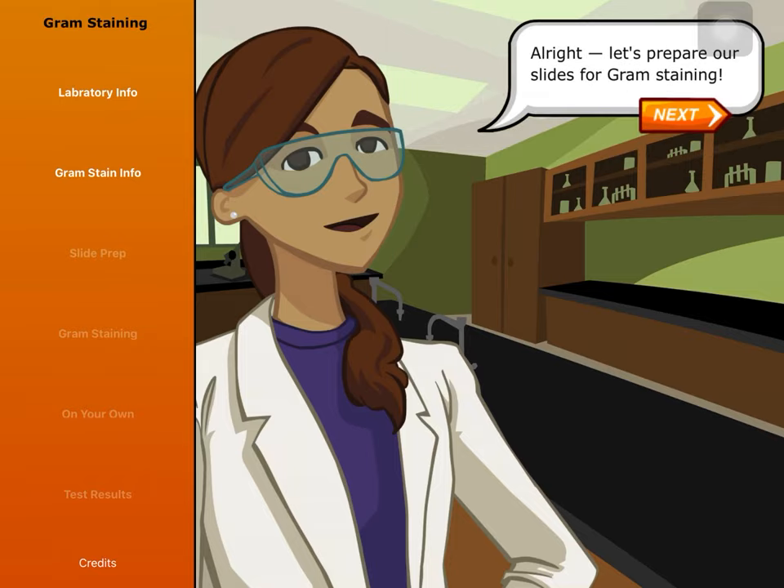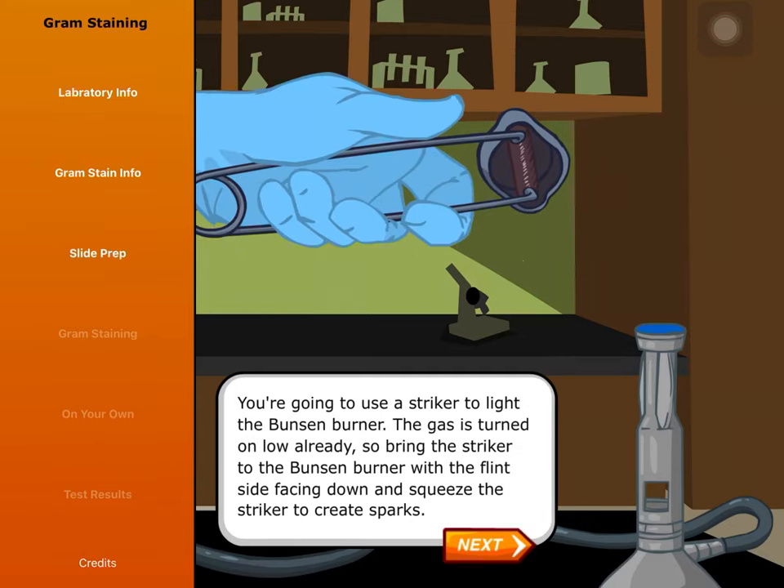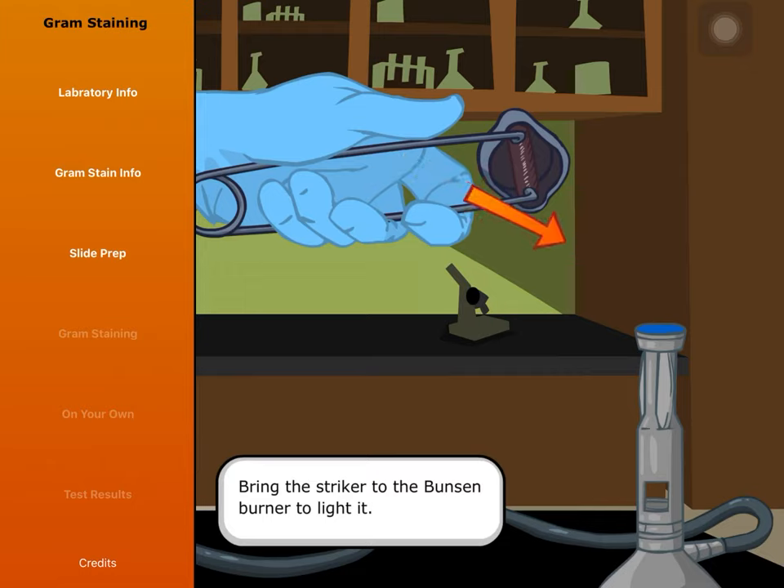Alright, let's prepare our slides for gram staining. To prevent bacteria from contaminating our work area, we have wiped down the table with a 70% ethanol solution. We will also light a Bunsen burner to sterilize the inoculating loops we'll use later and help maintain a sterile working environment. You're going to use a striker to light the Bunsen burner. The gas is turned on low already, so bring the striker to the Bunsen burner with the flint side facing down and squeeze the striker to create sparks.